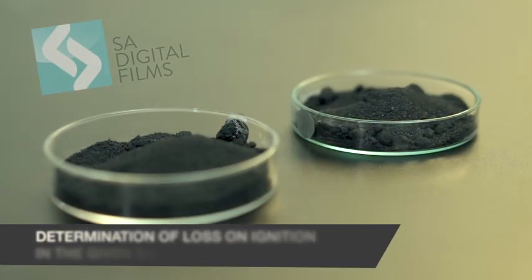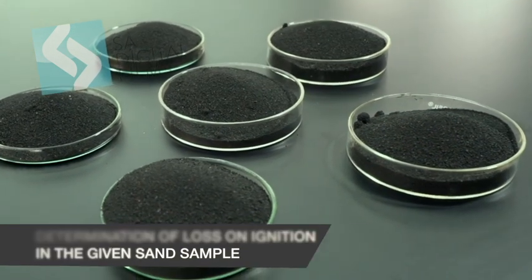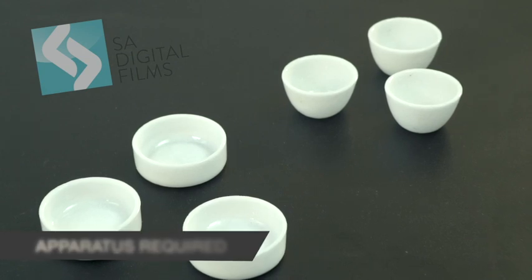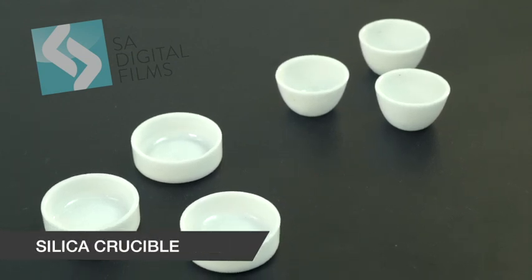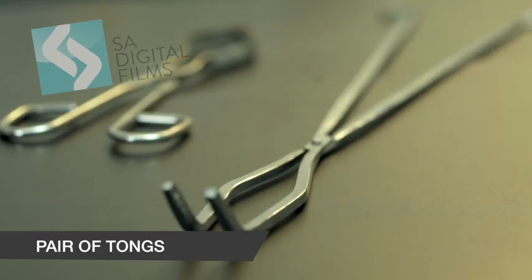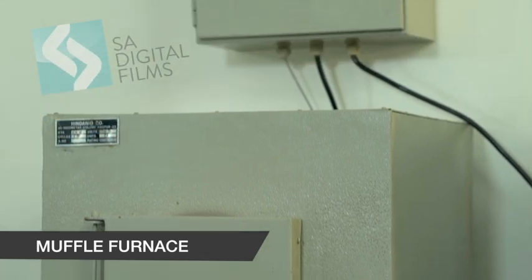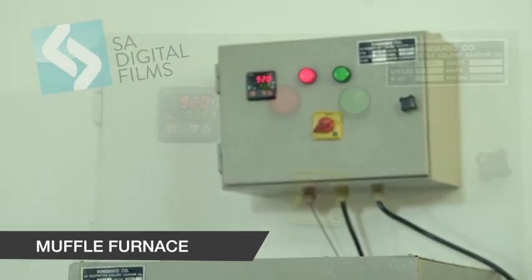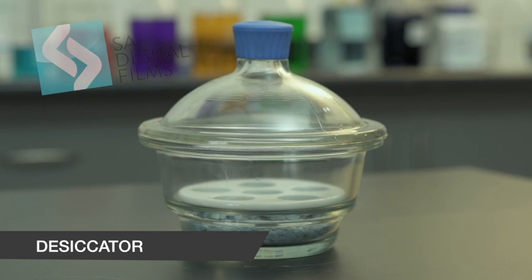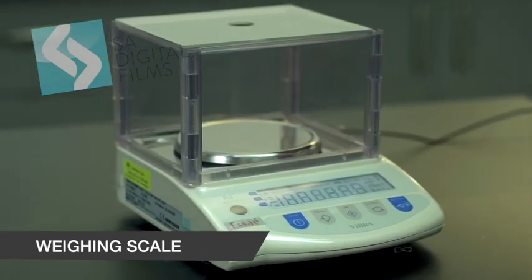The objective of this tutorial is to accurately determine loss on ignition of the given sand sample. For this analysis, we will be requiring a silica crucible having capacity of 25 ml, a pair of tongs, a spatula, a muffle furnace capable of providing a uniform temperature zone of about 920 degrees Celsius, a desiccator, a stopwatch, and a weighing scale having a least count of 1 milligram.